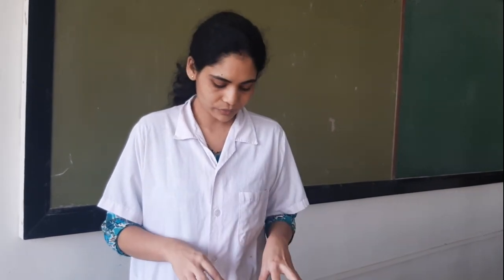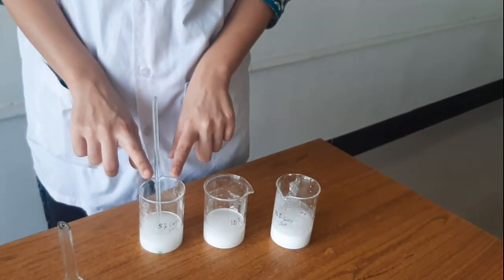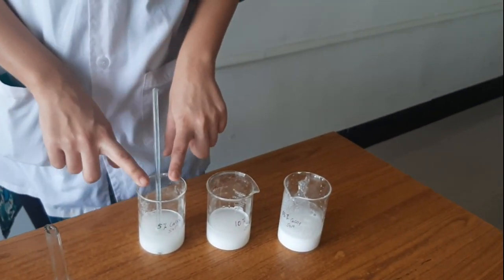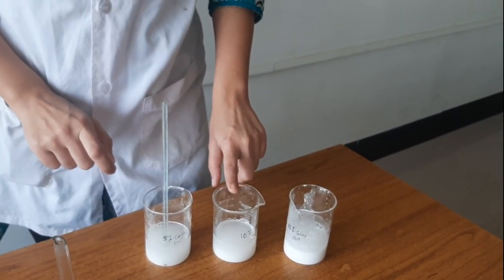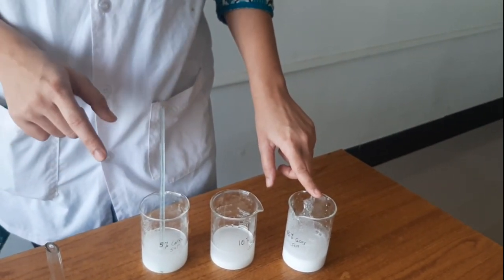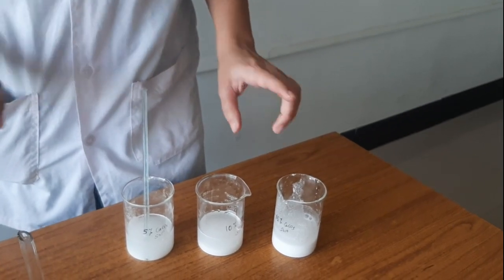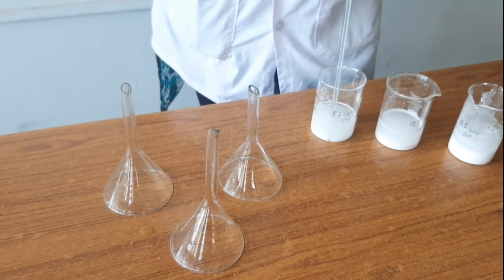In part B, we have to take all the funnels of the same size, and we have to take slurries of different concentrations. We have prepared a 5% solution of calcium carbonate, that is, we have dispersed 5 grams of calcium carbonate in 100 ml of water. Then a 10% solution, 10 grams in 100 ml, and a 15% solution, meaning 15 grams of calcium carbonate in 100 ml of water. Now these are our 3 funnels which have the same size, the same surface area.